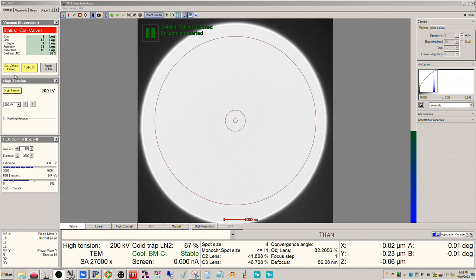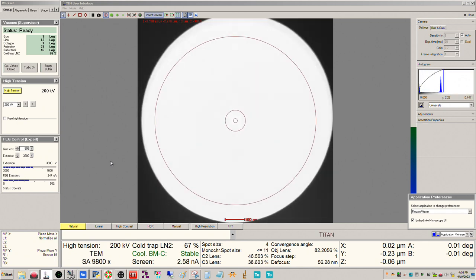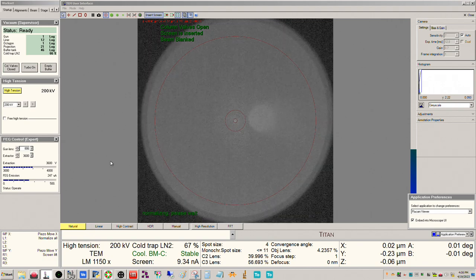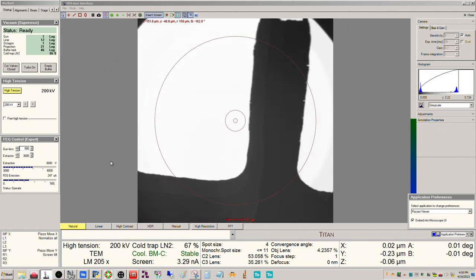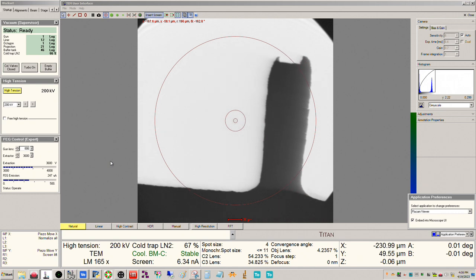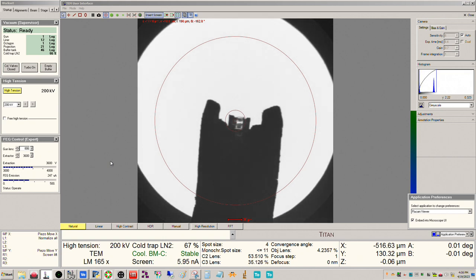We're going to cover a whole bunch of good stuff here. So first order of business is let's find the sample. So the sample is a photonic device structure that is a series of quantum wells, and they are alternating arsenide-based semiconductors, and this active region is surrounded by an indium phosphide matrix. So all in all, there's five different elements in the material that we can use to map, and we can map them down to atomic resolution, which is pretty cool.